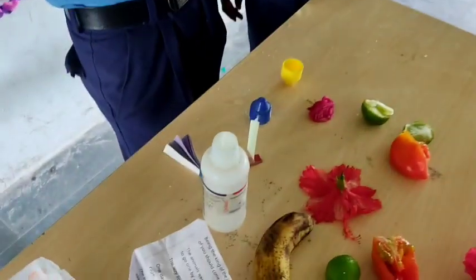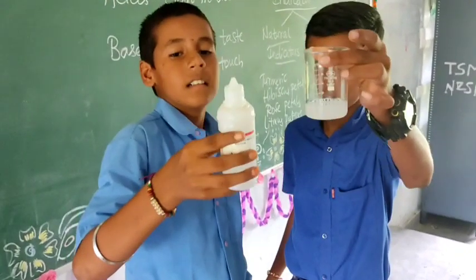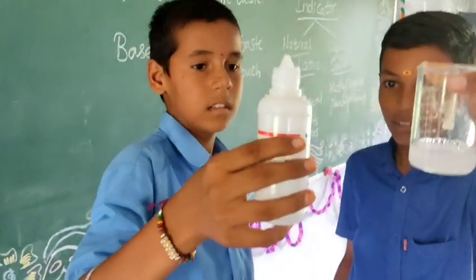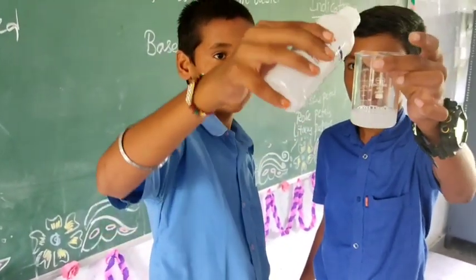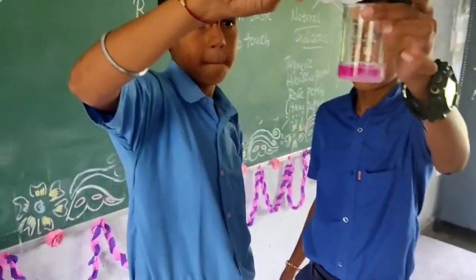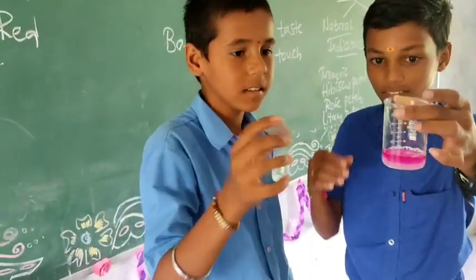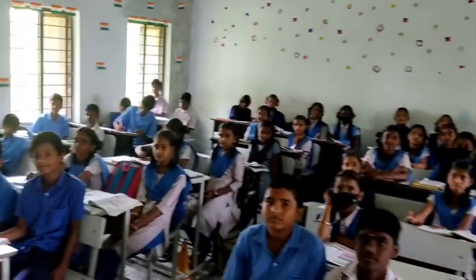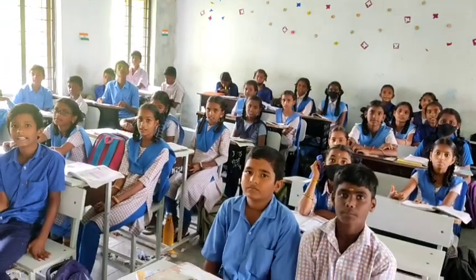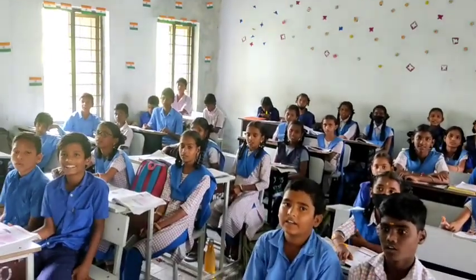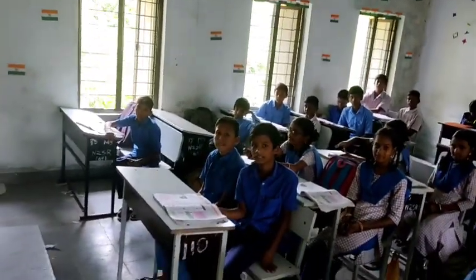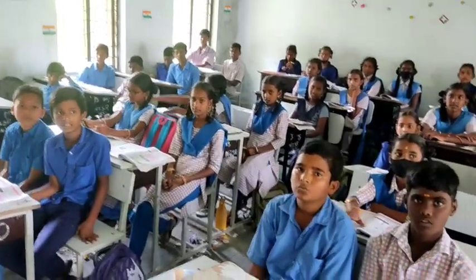Next, we test the Soap Solution with Phenolphthalein. We take the Soap Solution again in the beaker and add a few drops of Phenolphthalein indicator. The Soap Solution is changing into pink color with Phenolphthalein. So with Methyl Orange it changed to yellow color, and with Phenolphthalein it is changing into pink color. We can confirm that the Soap Solution is basic in nature.